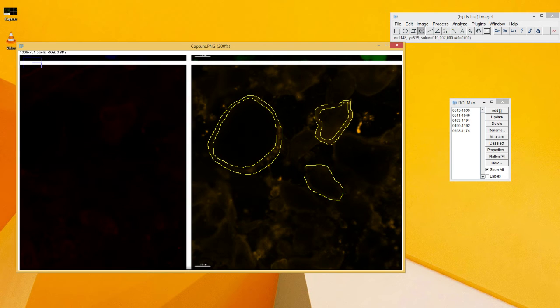Also you want to make sure you always stay in the same order, otherwise it's going to mess up your Excel sheet later and cause you problems. So you always want to draw the outer circle first and then draw the inner circle. Maybe this guy right here. This one's pretty subjective because I can't really clearly see where the ring is ending and beginning. But I just wanted to show you this in case it might be a good way for you to do this calculation. Okay, now we have four of these drawn.